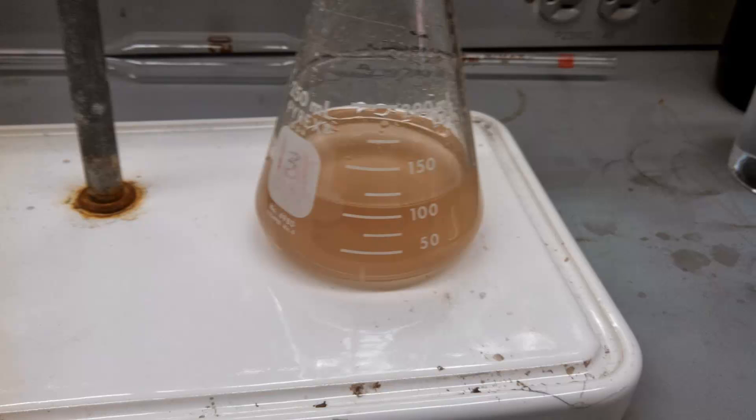At the end of the titration, the starch does not look pretty. All right? There's still a cloudiness in the solution. The important thing is that the blue color, the triiodide complex to the starch, is gone. This picture was taken during the determination of the vitamin C in a vitamin C tablet, and the tablet has some colored dye in it, so it makes it look kind of nasty when you get to the endpoint. The important thing is that the blue color from the starch-iodide complex is gone.